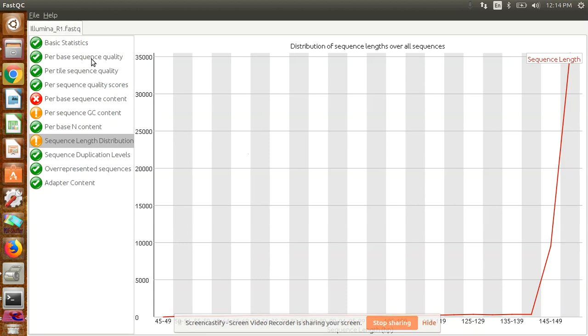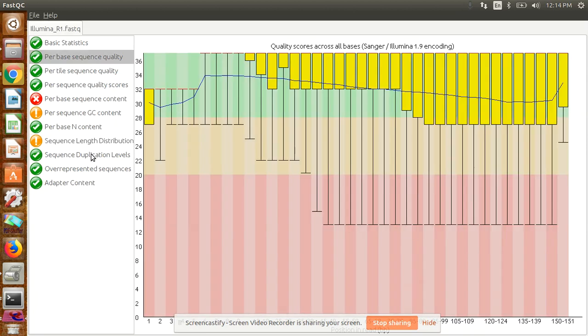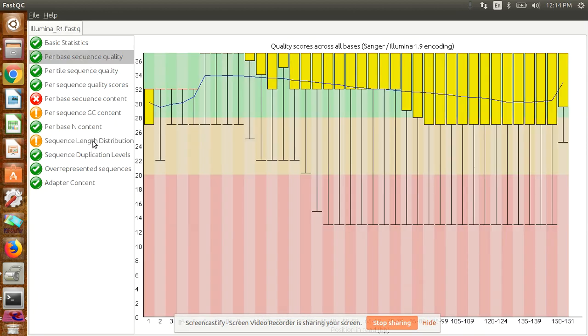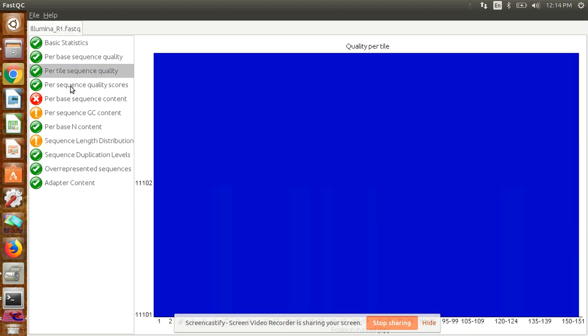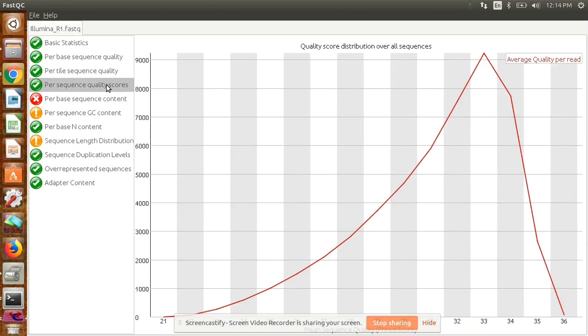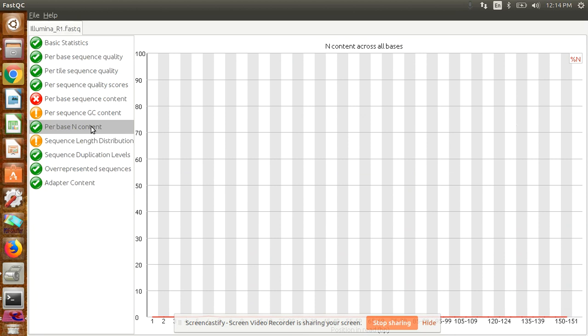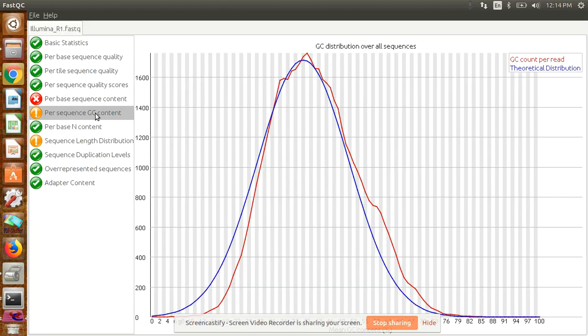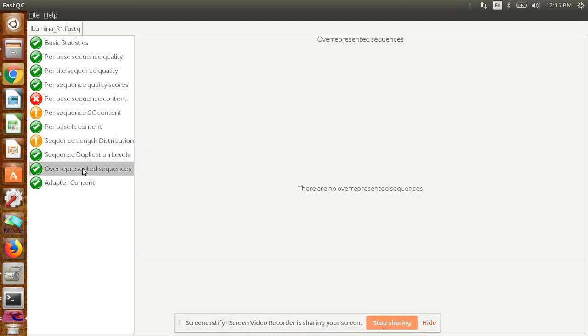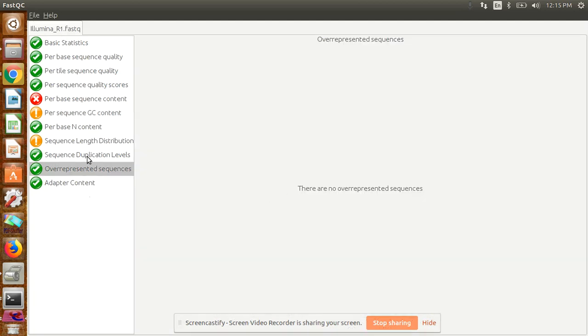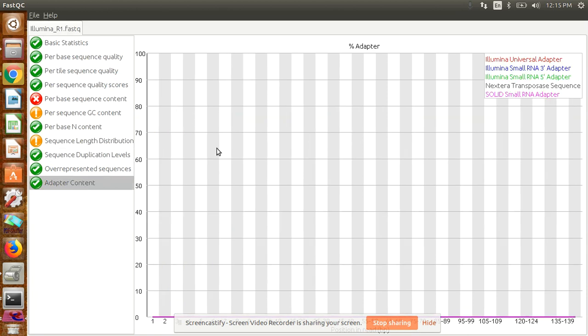These are the two parameters that are very important for checking quality. Other parameters also—per sequence quality score is there, N content is zero percent so ambiguous bases are not there, GC content you can check. Theoretically it should be the blue line, but we're seeing the red line, which is somewhat okay. Overrepresented sequences—there's no such type of sequence. Duplicate level, adapter content is not there.